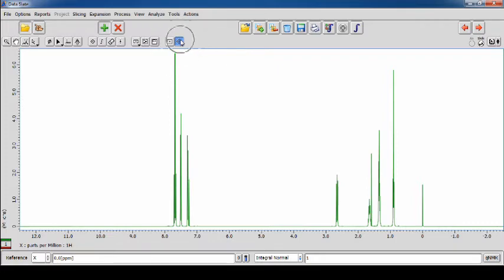Pick Position and Perform Action has limited function in 1D NMR processing, as it is intended for use with data of higher dimensions. Practically, it is the same as copy position to paste buffer without copying the data to a paste buffer.